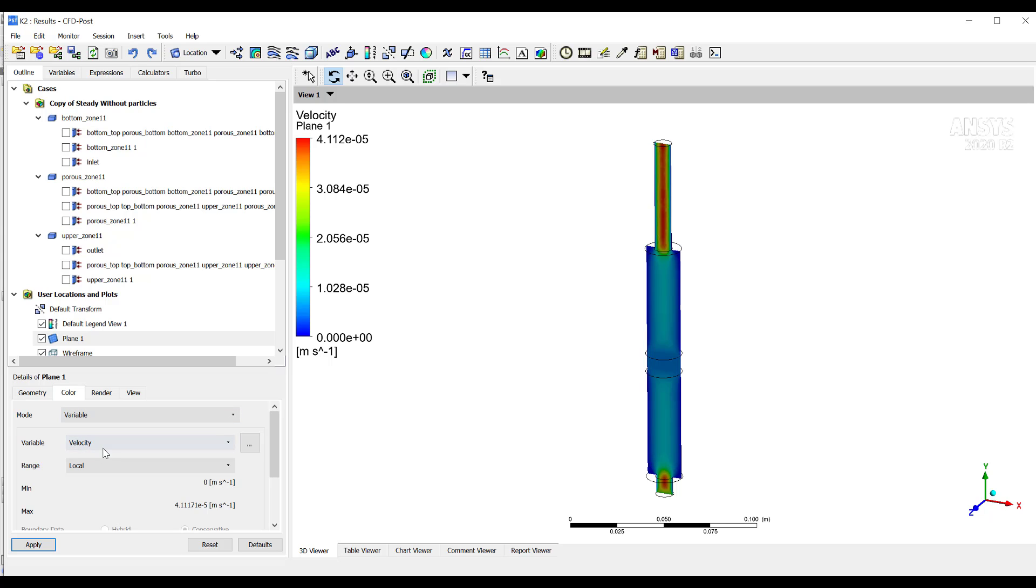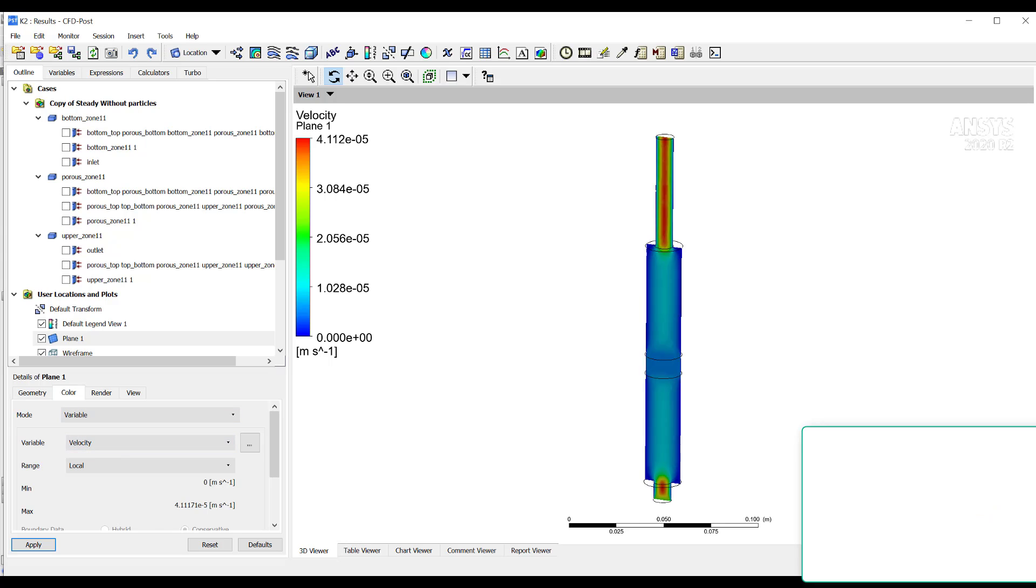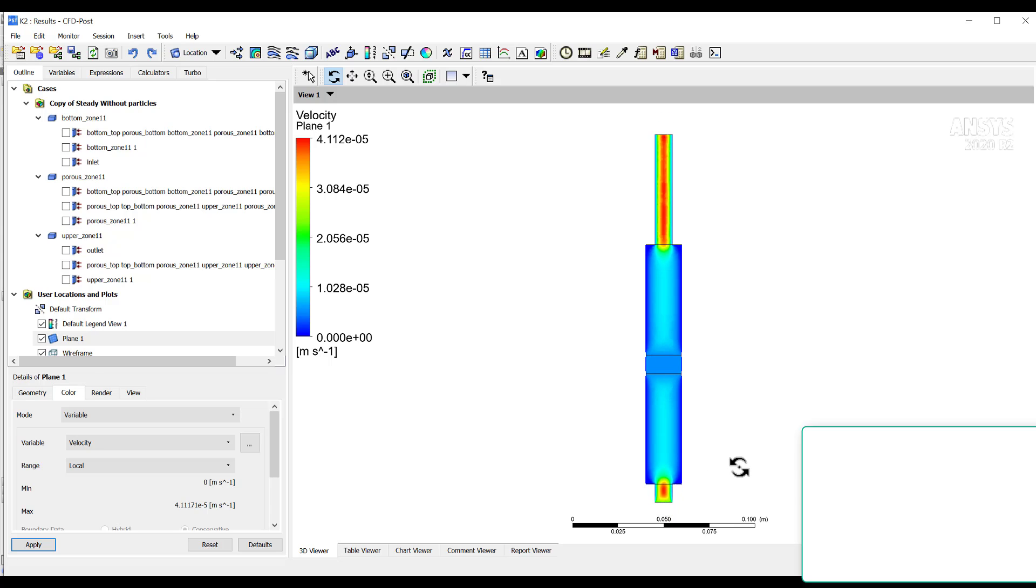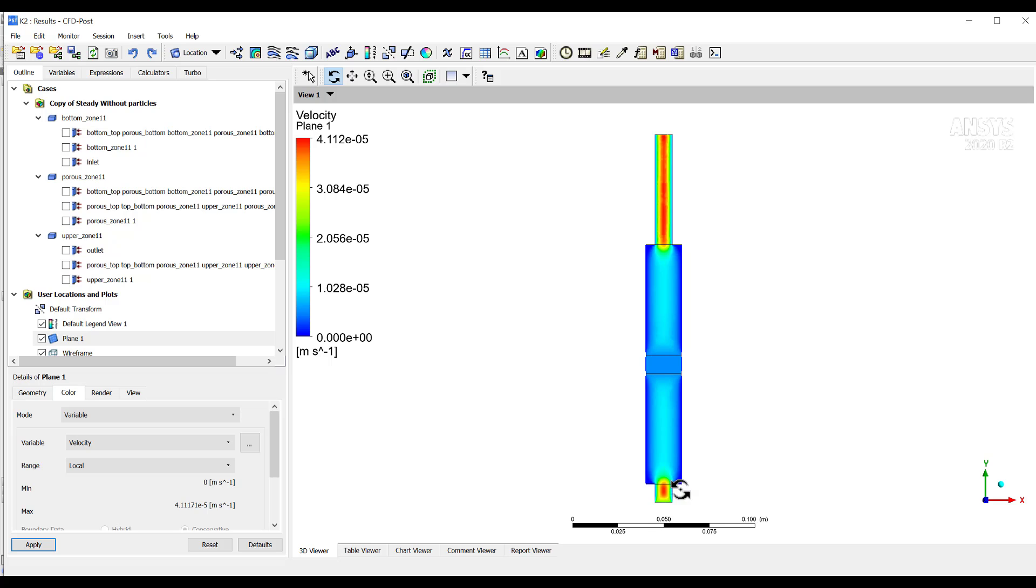And the color, I color it by velocity. And this is what I have right now. That is a reduction in velocity in the porous zone, in the porous region, and an augmentation of the velocity in the inlet and the outlet that have a smaller area.